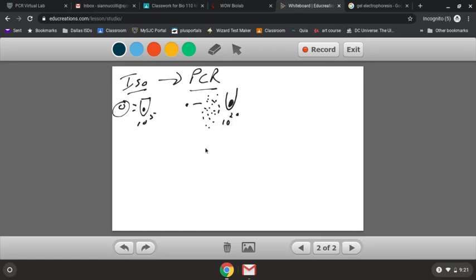We've amplified it. What we want to do now is compare, and we compare with gel electrophoresis. I'm not going to write the whole thing out. What we're going to do here is compare DNAs. One really good example of a usage for gel electrophoresis is at a crime scene, and I think that's what the lab is about, because it's talking about a crime scene.